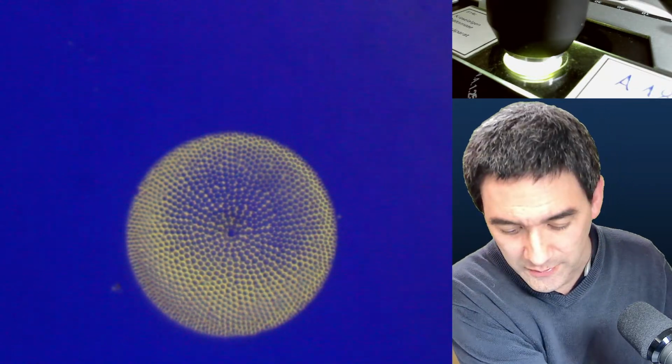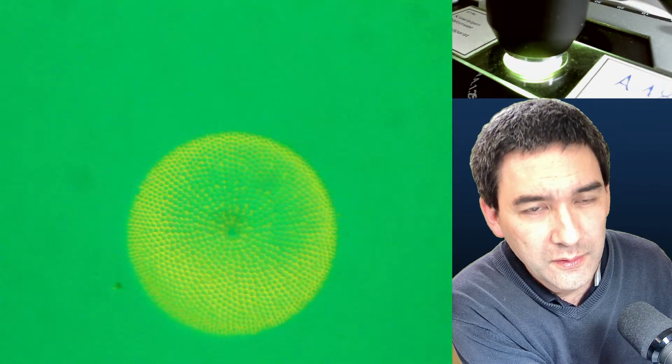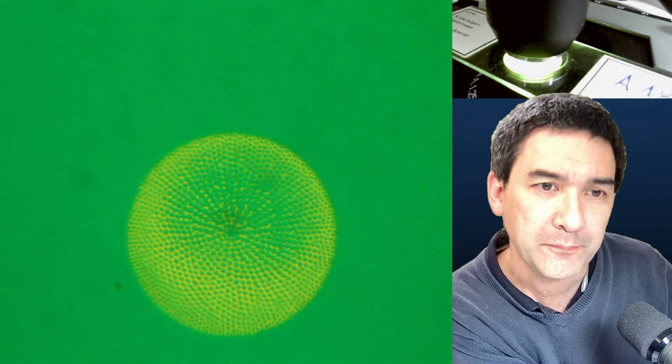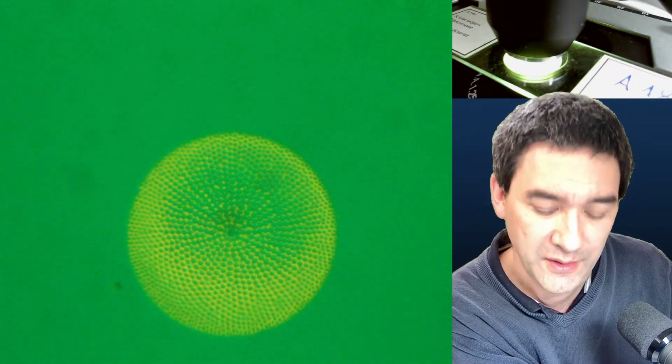So let's try a different one. It's the blue-yellow one. Let's try the yellow-green one. That looks nice, but maybe the contrast is not quite as high as with the blue-yellow one.